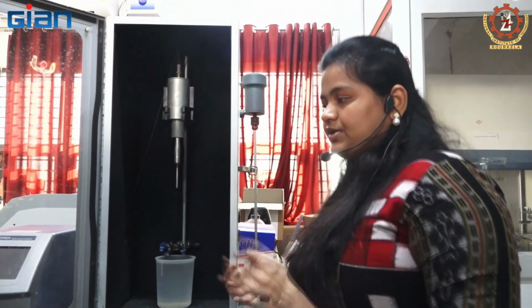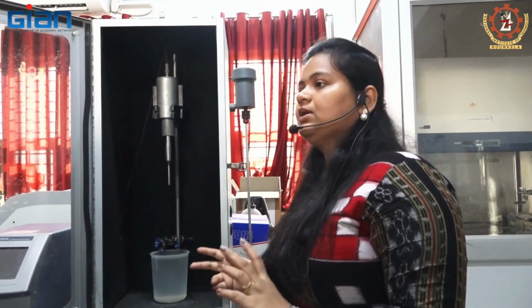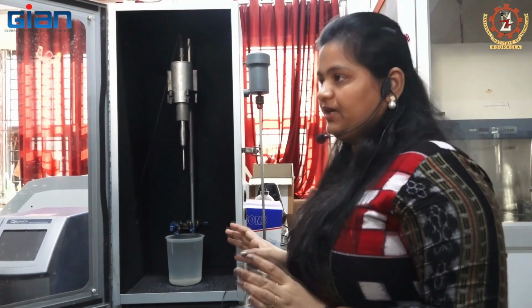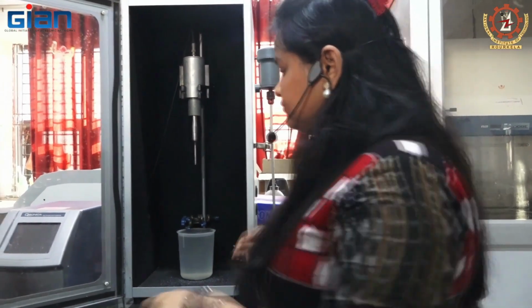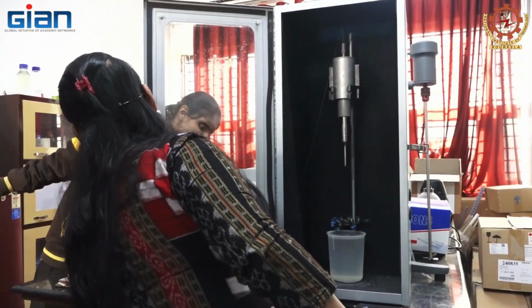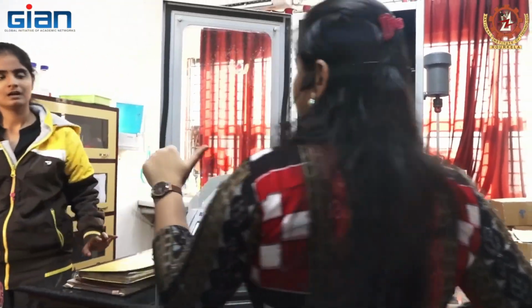How? One is the preparation of the sample, then the extraction process, and the second one is the separation or the filtration process.